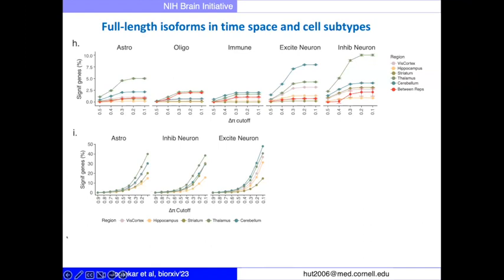And you see on the axis here, you have basically distinct cutoffs for how different it must be. So first we have a p-value that must, of course, be significant and corrected for multiple testing. But then we have an effect size where we basically ask how strong of a brain region specific effect that is. And when we ask for relatively small ones, here we get maybe 40% of the genes. And of course, when you ask for larger effects, it goes down, down, down, so that when you ask for dramatic effects, then it's actually not that much.